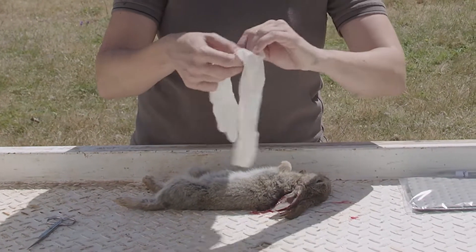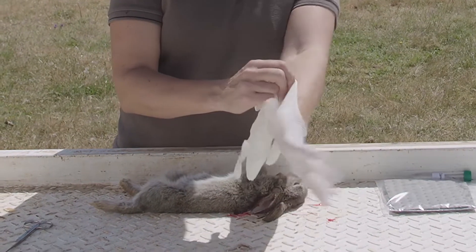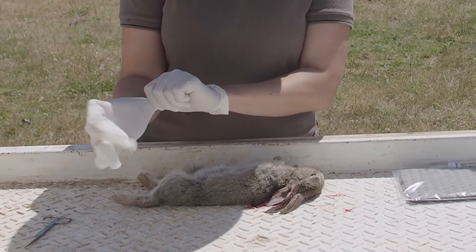If you have gloves, it's recommended that you get some — you can just use food grade gloves that you buy from the supermarket. It will just help protect against contaminating samples between rabbits if you find more than one, and also just keep your hands clean.